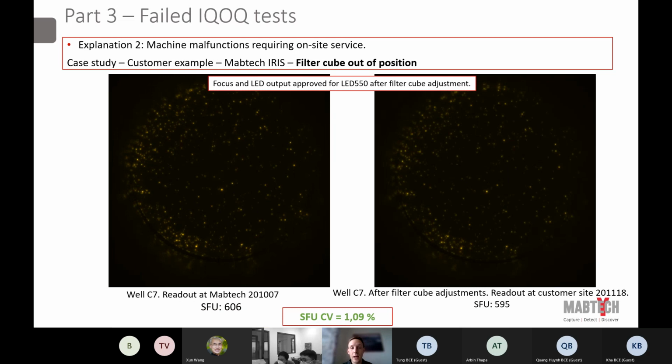As mentioned, IRIS is a more complex machine since you're working with FluoroSpot modes as well. So the risk that IRIS machines will require service-related work is a little bit higher compared to ASTOR. As mentioned, I don't think we have ever had to do urgent ASTOR service work due to hardware issues in any way.